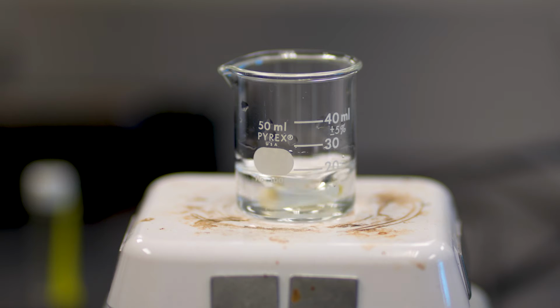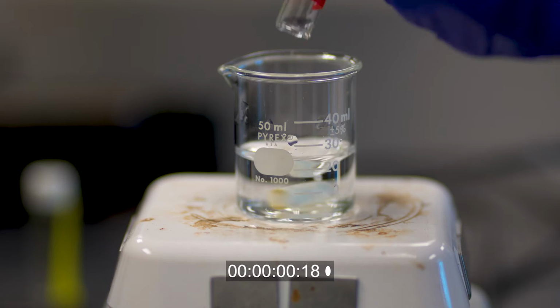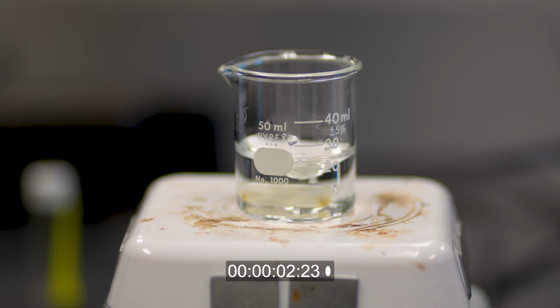The contents of test tubes A and B were mixed, and in that instant, the timer was started. As soon as the color change was observed, it indicated that I2 had reacted with starch to form a complex. So, the timer was stopped and the time recorded for future kinetic analysis.